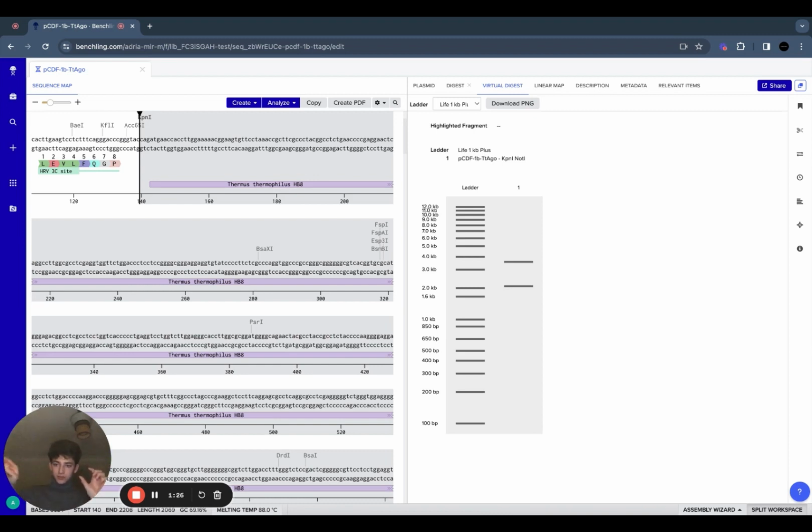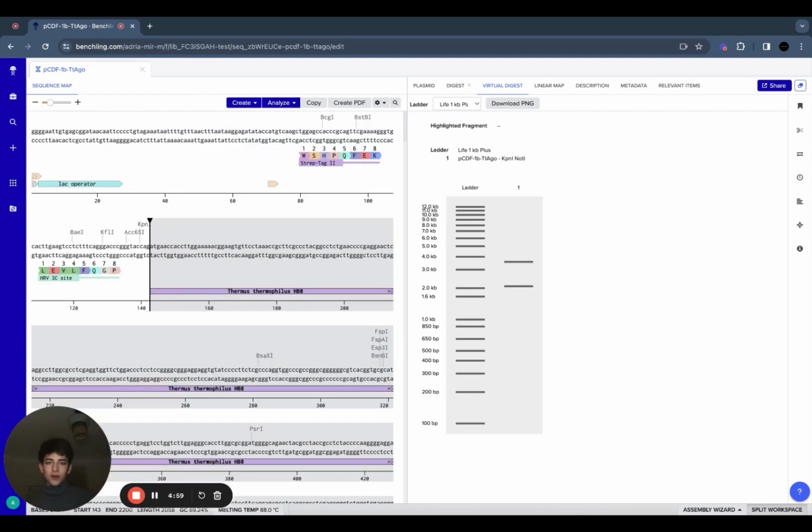You've got like a squiggly line that once made up the entire circle, and you have another little shorter squiggly line, which is the gene that we've just taken out. So we have isolated it. So like I was saying, this is a test that's commonly done by scientists. This gray box here is just a piece of gel where both pieces of the DNA are placed up here, and down here you have a positively charged material. Like DNA is overall negatively charged, the pieces of DNA will slowly move closer and closer to the positively charged material because positive and negative attract.